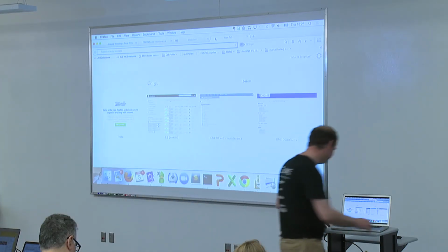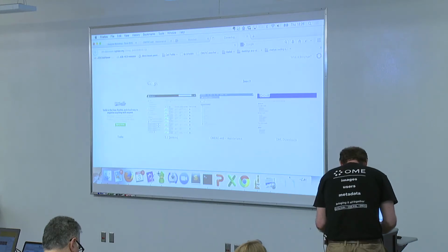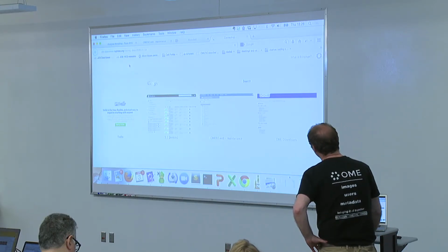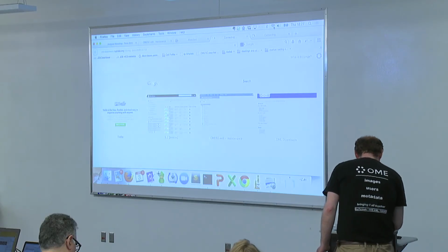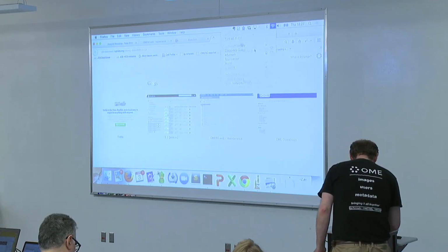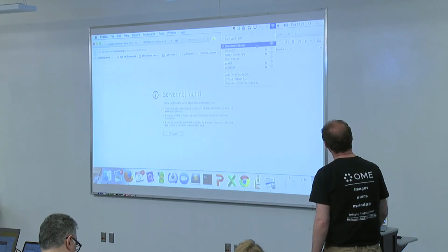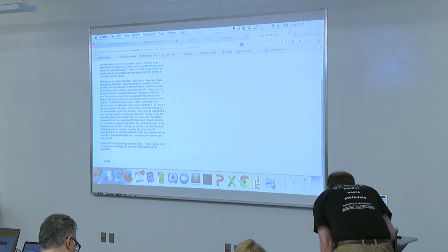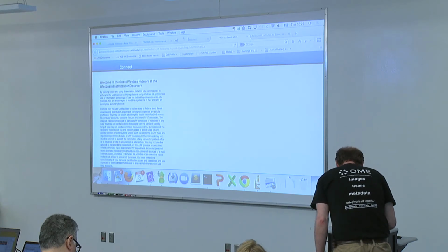You have to give me 2 seconds to retrieve it. Maybe it's okay. Let's see what comes, because this is something I've shown to somebody already. I have some metadata here as well. You might still be on the local network. Yeah, I am. Thank you very much. Yeah, that will be my downfall. Okay, so let's leave Tadpole now in peace and try to get to a normal internet, and I'm being welcomed, and that's it. Right. Okay.